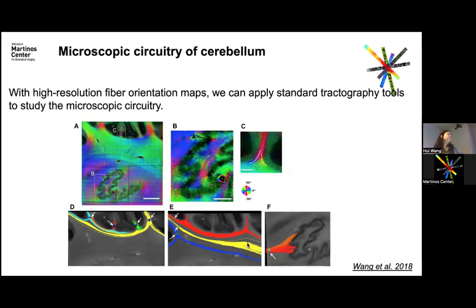I sort of think that's a limitation of the traditional tractography tools. So here it just shows maybe in this region, that's a small seed that you start. So basically it shows that in this region, more fibers are following this direction. And then the tractography will just follow that. That's my interpretation. I'm not 100% sure if it really preserves that, or if it spreads out more.